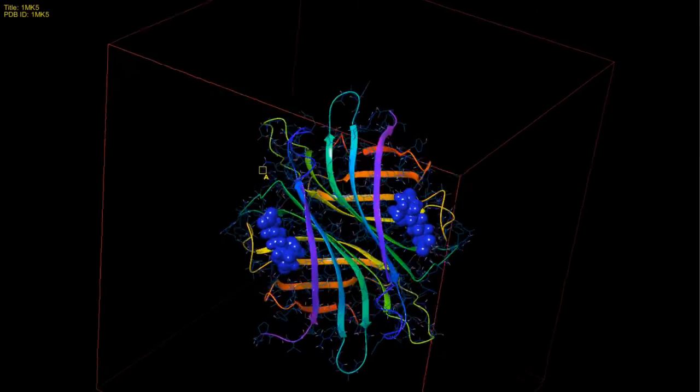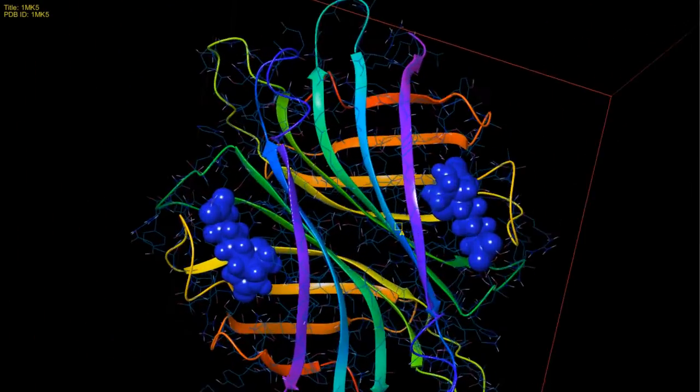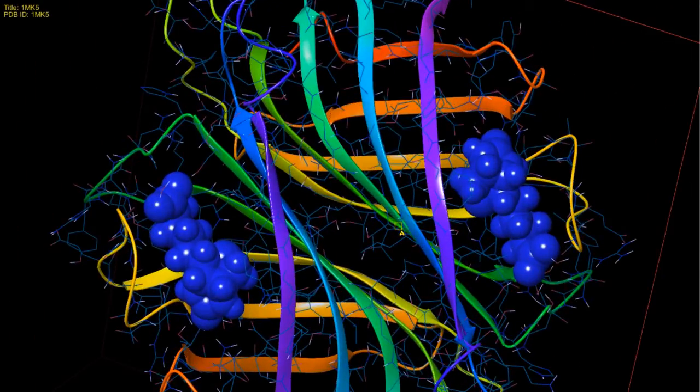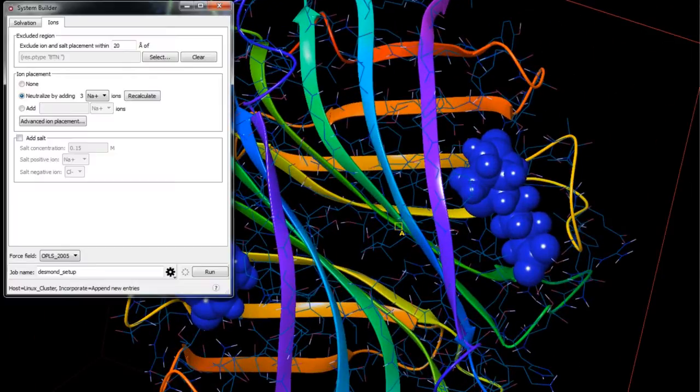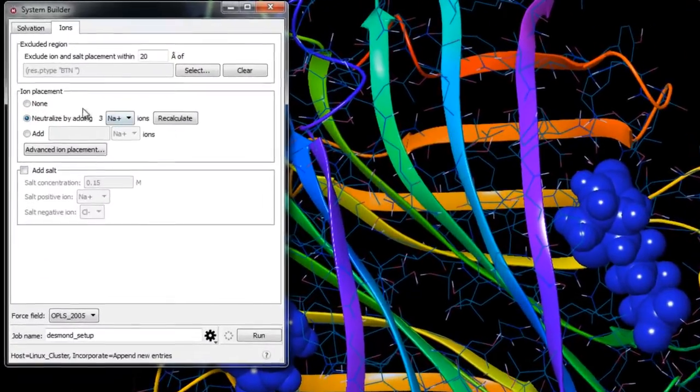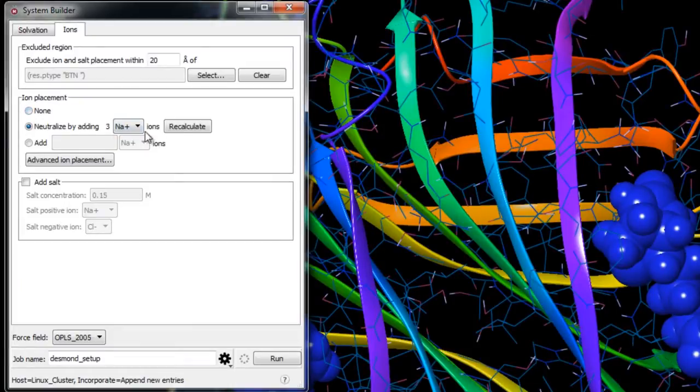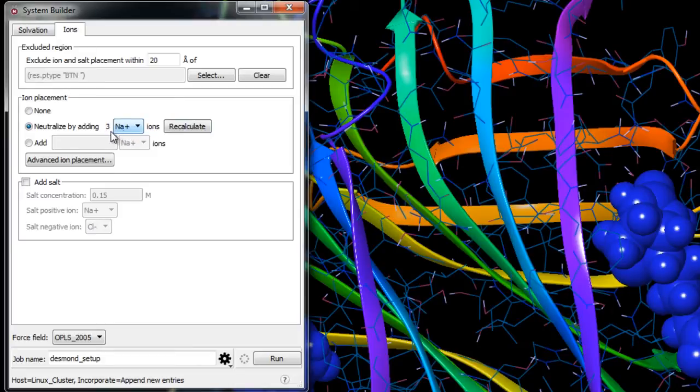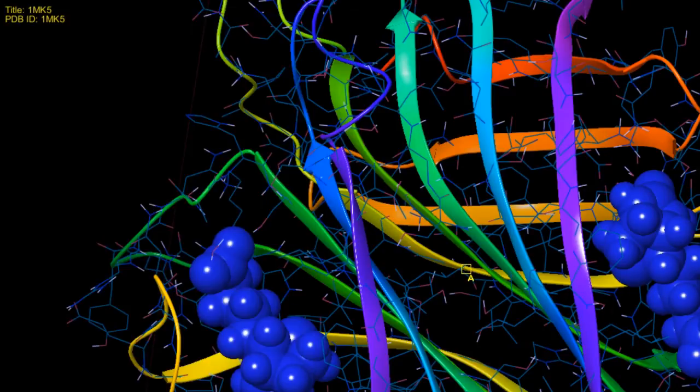For the ion placement we'll recalculate to set the number of ions needed to neutralize the system. Here it's saying it will add three sodium ions. This makes sense because the status bar down below indicates the protein has a charge of negative three.